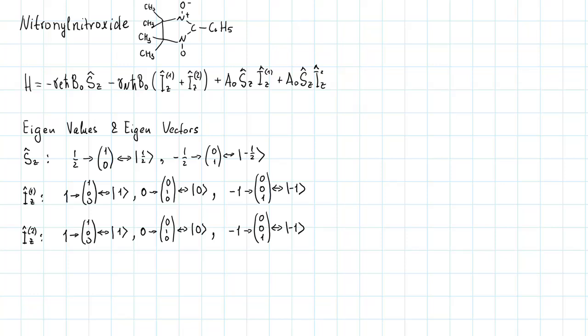Here I have to say that the spin states of both nitrogen nuclei are the same only in some special sense when they are considered as the building blocks of a more general quantum state of the whole radical spin system. In this general state, they will be distinguished by the places where they enter the general product state of the whole radical spin system.